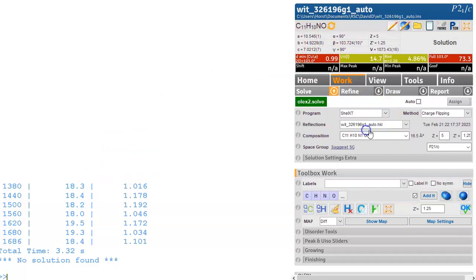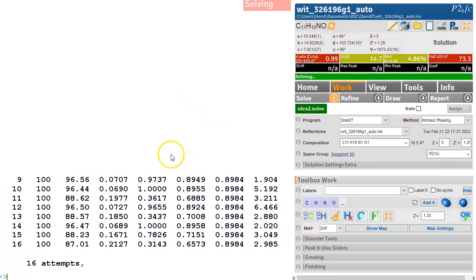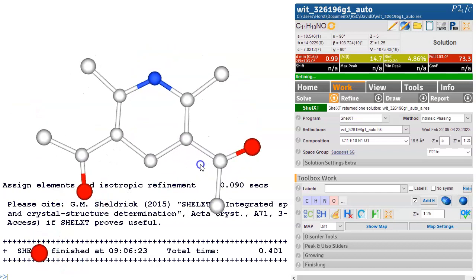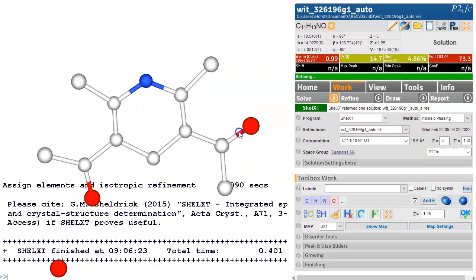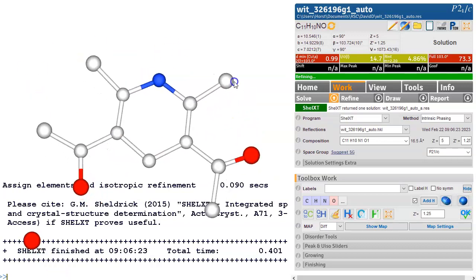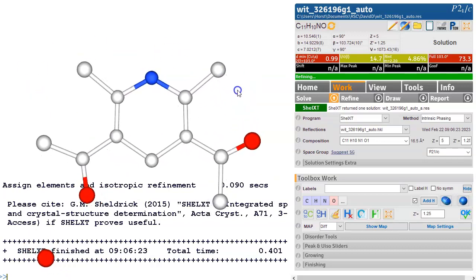So let's use ShellXT for this example. ShellXT really is the go-to thing that solves almost every problem. So yeah it solved this and it's got some atoms in here. So this is what ShellXT does. It does the structure solution which should normally give features peaks but it also does some atom type assignment that is usually quite correct. So we've got this here it's a molecule looks like a six-membered ring like everything looks fine.